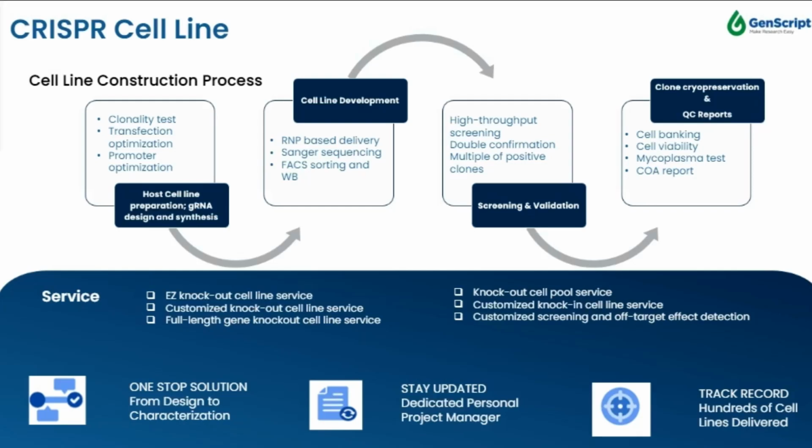Schematic of the process used to generate the knockout cell pool is shown here, and the steps included in this process are design and synthesis of gRNA, transfect the cell, analyze the editing and knockout efficiency, and conduct the assay. The generation of CRISPR-mediated gene knock-in or knockout cell lines involves substantial workload, and thoughtful design of the gRNA template is necessary for generating functional gene knockout and knock-in, which enhances the editing efficiency.